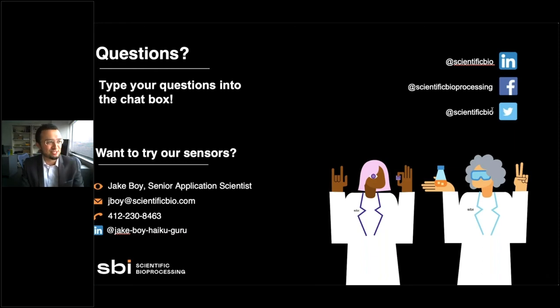That's a very nice question, because I have struggled with that before. I think the person who asks this question realizes that it's very frequently said in these spheroid papers that the core of spheroids are hypoxic, but finding those measurements is much more complicated. I have found a couple of references in which the core of spheroids, and not only the core, but the entire cross-section, is characterized in terms of oxygen distribution.